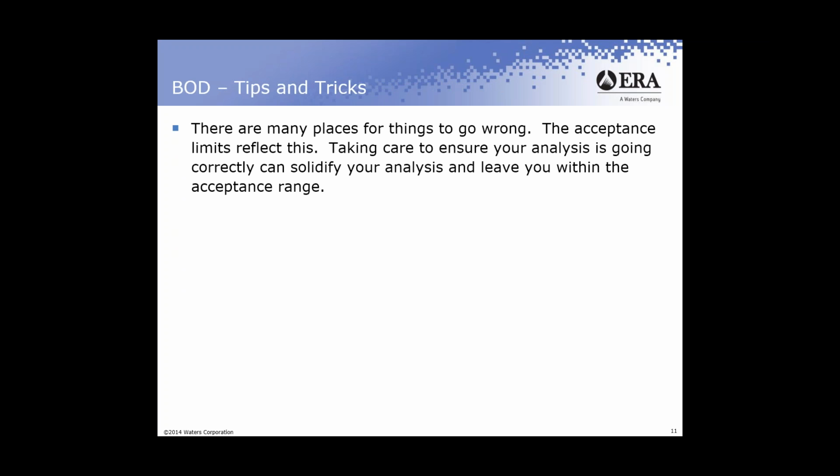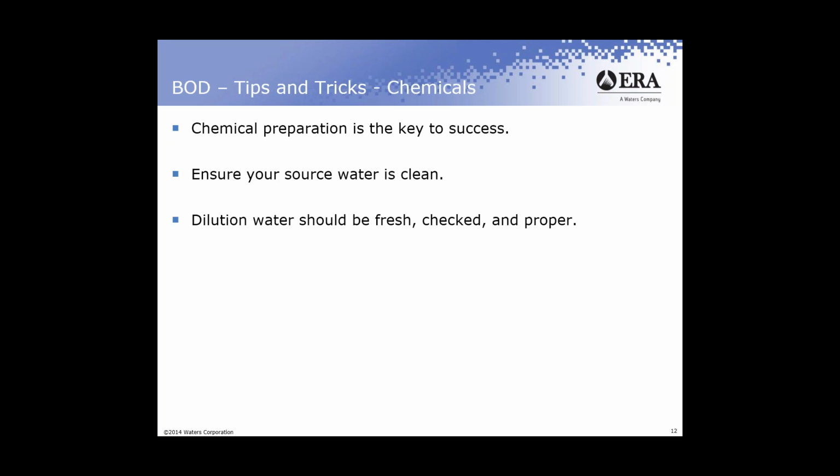Taking care to ensure that your analysis is going correctly can solidify that analysis, leave you within the acceptance range, or make sure that your analysis is proper so that if you're discharging your effluent back into the environment, saying it's clean, you know that it's clean. So I'll bring that up a couple of times because there are a lot of places for things to go wrong in what we consider to be a relatively simple method.